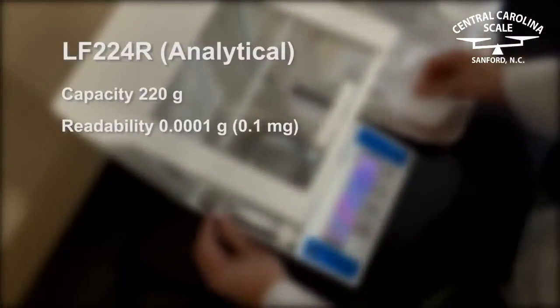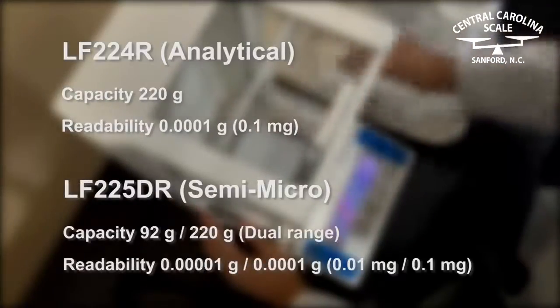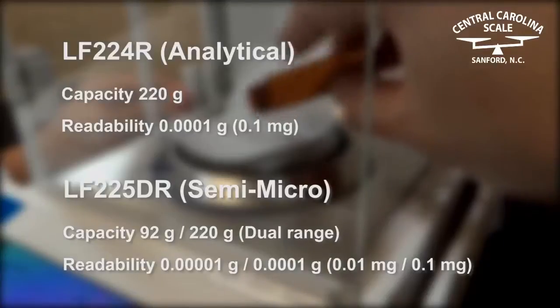The LF-224R offers analytical weighing at a tenth of a milligram. The LF-225DR is dual range and offers semi-micro weighing at 0.01 milligrams and analytical weighing at 0.1 milligrams.